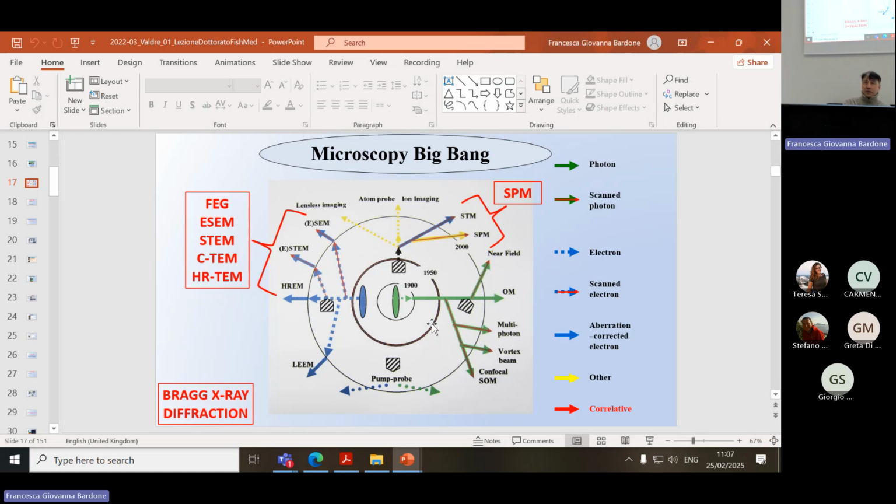First, we observe by naked eye our rock, our tissue, our clothes, whatever. Then we decide whether the object is to be studied. Then we observe with an optical microscope the feature we are looking for. Soon after we detect the feature with the optical microscope, we select the object, extract it, and put it in the other type of microscope, depending on what you are looking for.